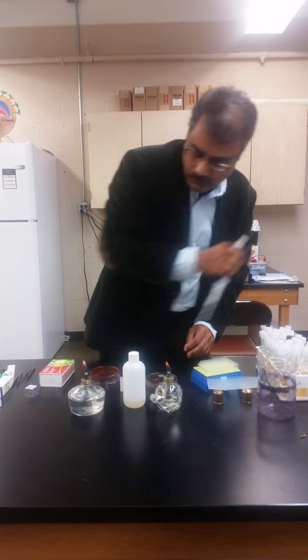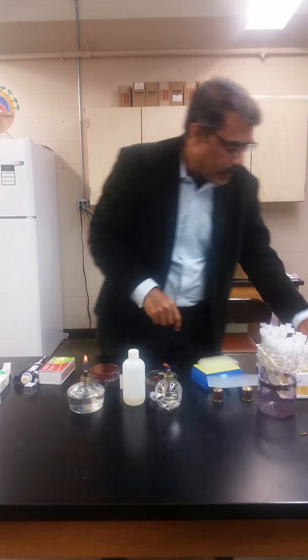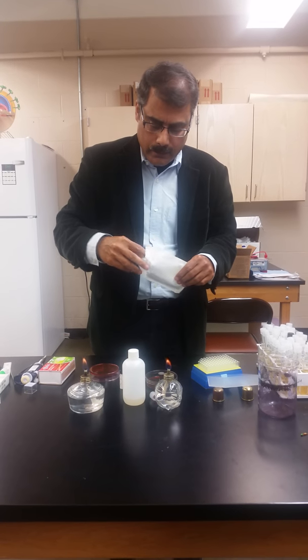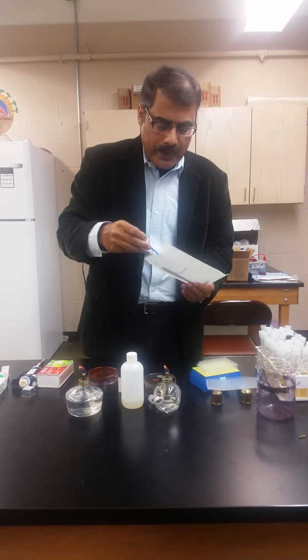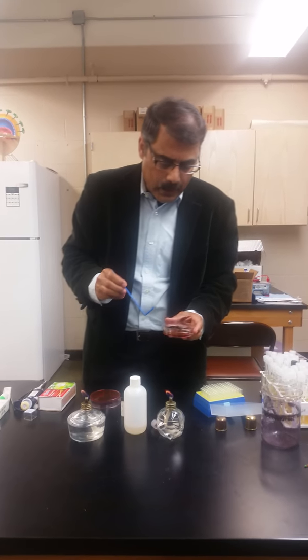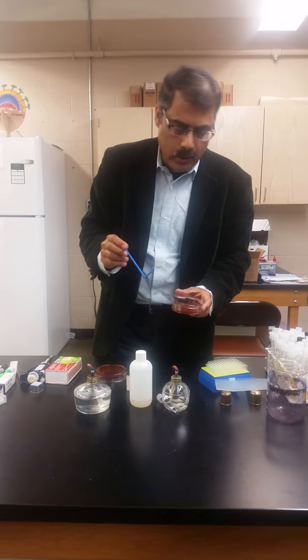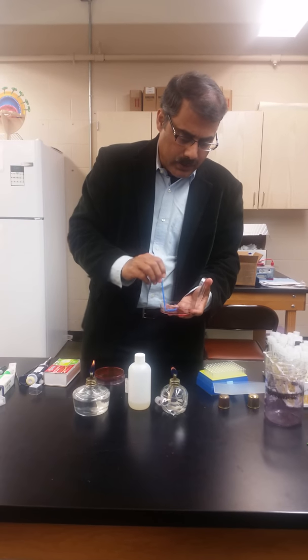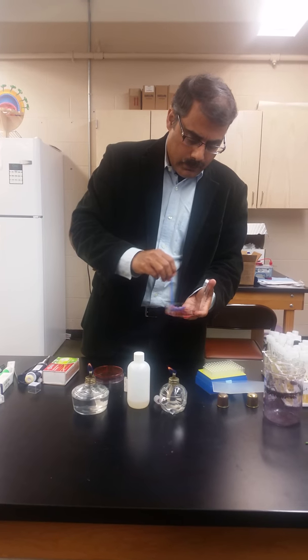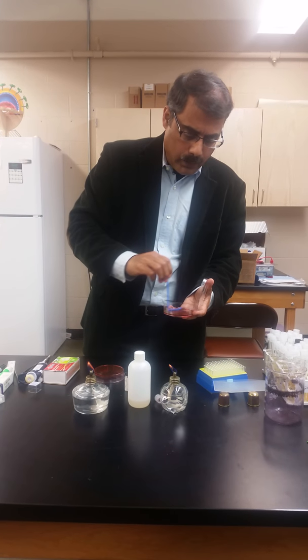This can go here. And now I use this tool called a hockey stick to spread these bacteria around on this plate. This helps because with the wire loop, you will basically damage the surface. This does not. So you basically spread your bacteria everywhere.